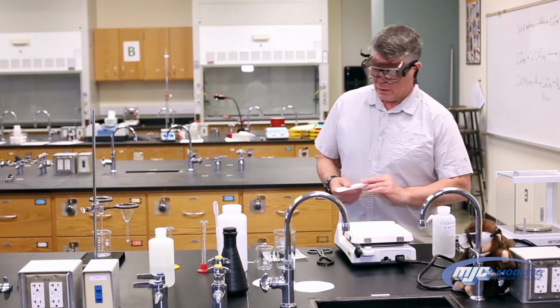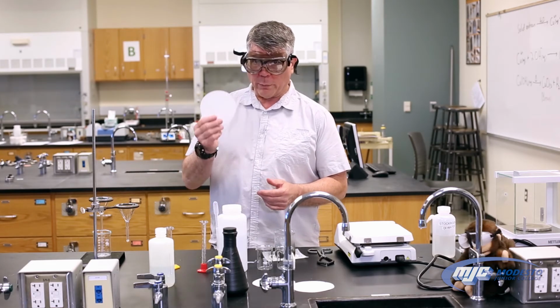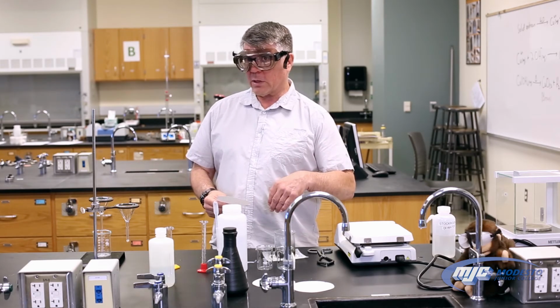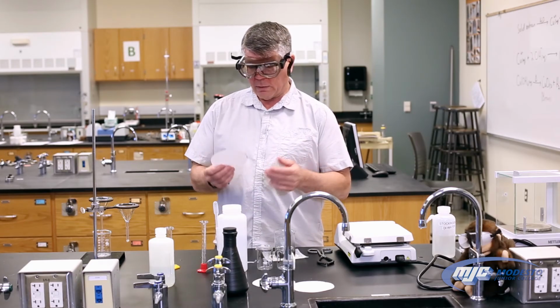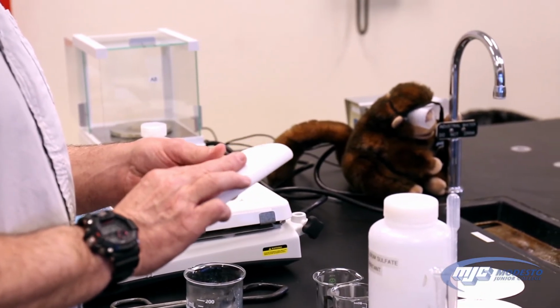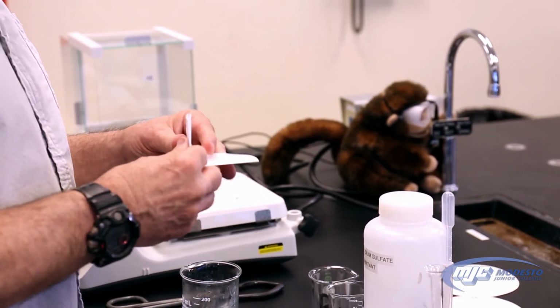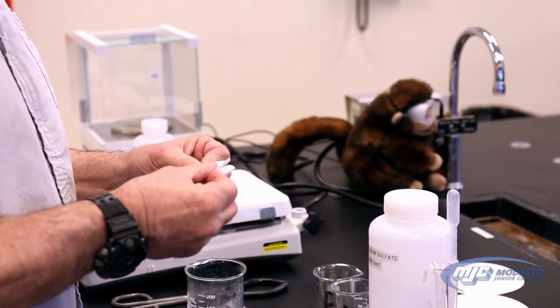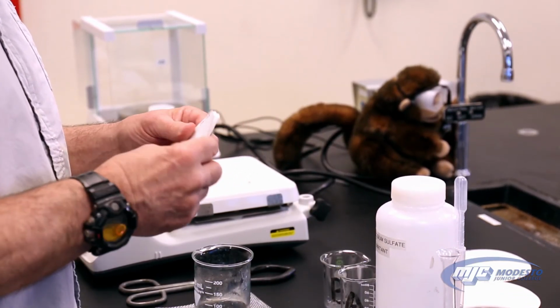Take it out. Now we're going to fold this filter paper and put it in this glass funnel. Now this is what we're going to use to separate the solid copper two oxide from the solution. So what we do is we fold this. There's a particular way we fold this. So where I wrote, I'm going to leave on the outside, fold it in half once, and fold that in half so it's in quarters. See if my name's on the outside there.